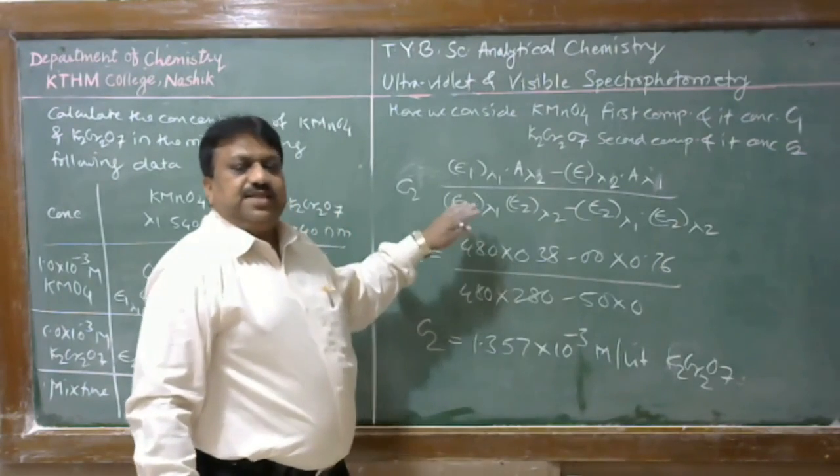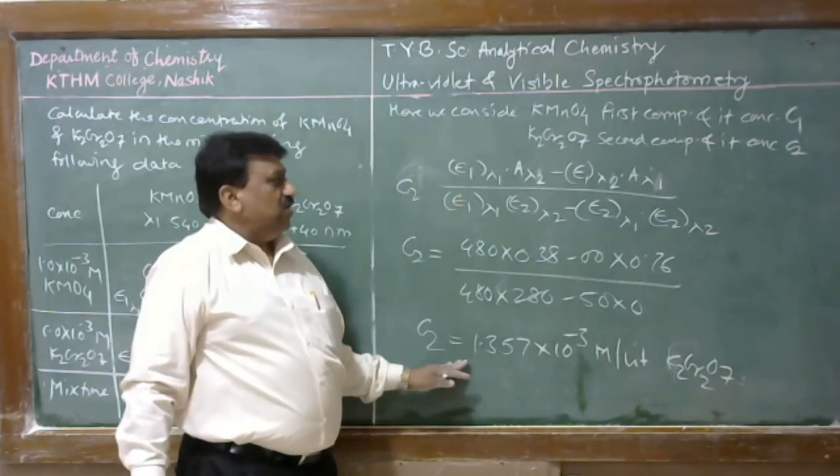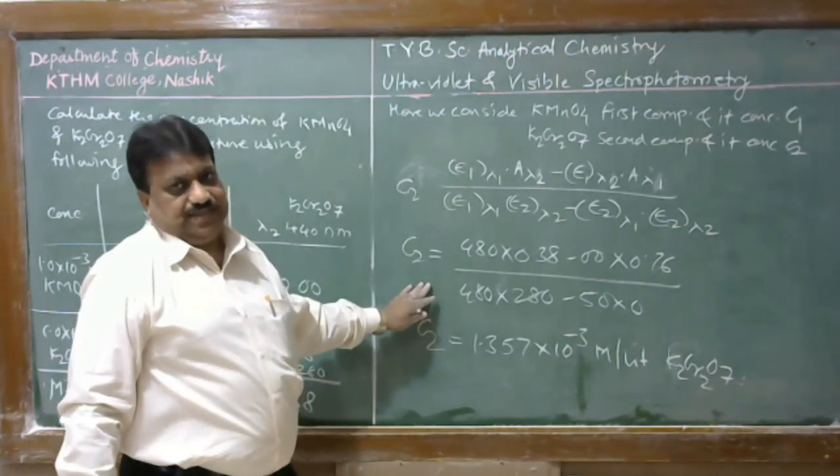Therefore, in this way, the additivity of absorbance principle can be utilized for determination of the concentrations C1 and C2 in a two component system.